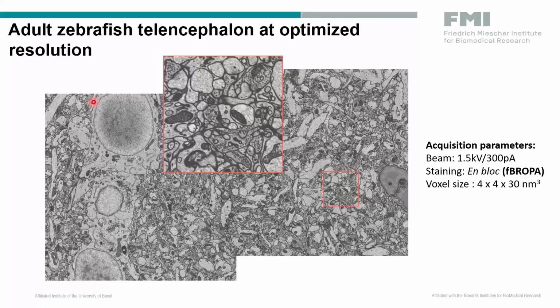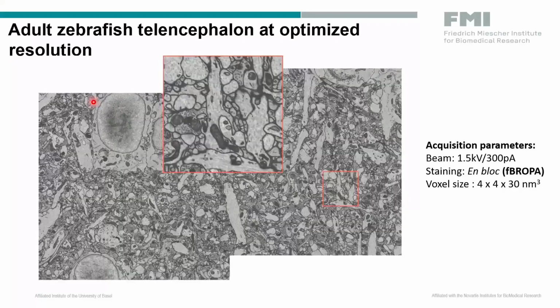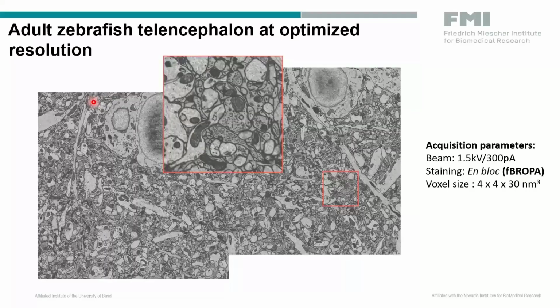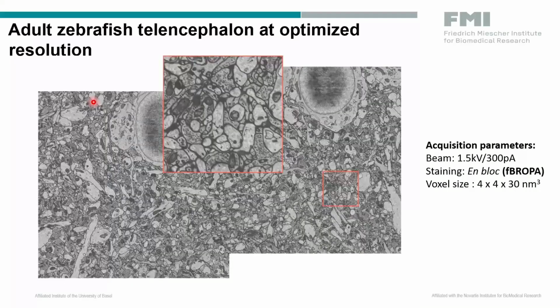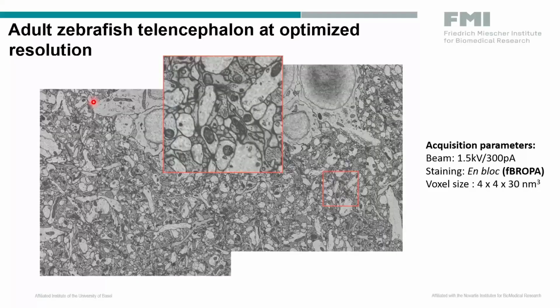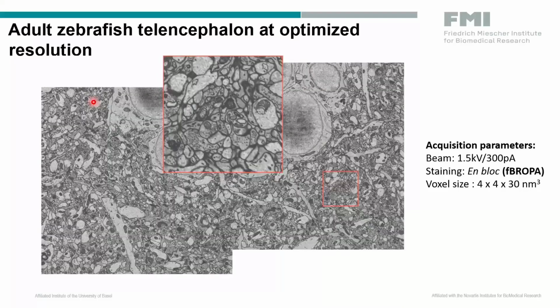Here it's again a video of stack acquisition of this telencephalon part of the brain in the adult zebrafish, you may notice that the nucleus are charging.